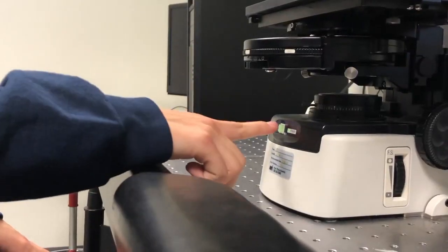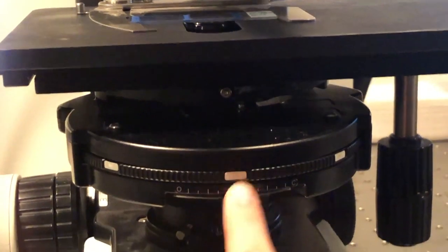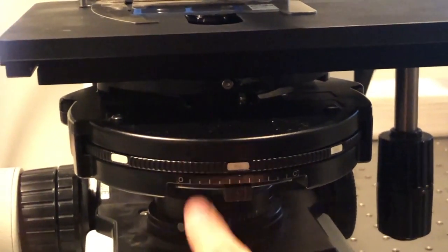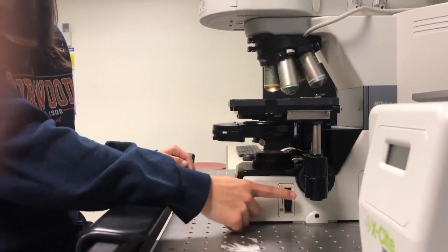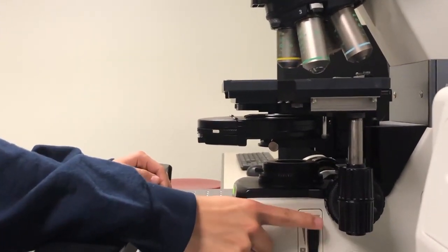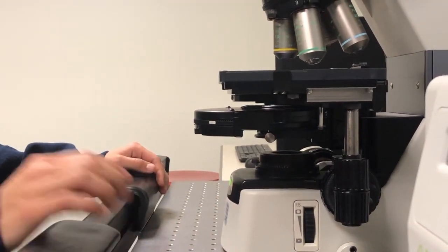For brightfield imaging, turn on the halogen lamp. Center the condenser wheel to the middle, and place the phase contrast wheel on Ph1 for phase 1. Now find the field diaphragm at the bottom right side of the scope. You will see it marked FS for field stop, and turn the wheel all the way down to close the field diaphragm to the smallest opening setting.